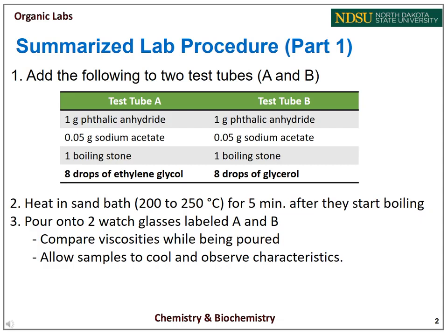We will be breaking the class into two groups so that as 3 groups are doing part 1, the other 3 groups will be doing part 2 of the experiment. Whether you are in group 1 or group 2, please begin heating your sand bath at the beginning of class so that it is warm and ready when it is your turn to complete the polymerization part of the experiment.